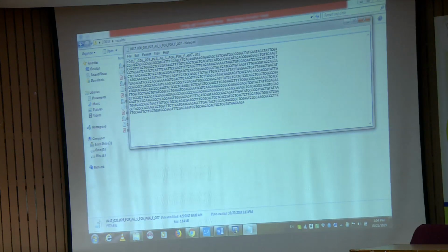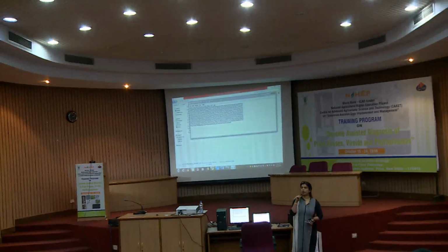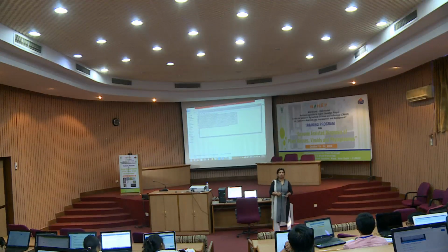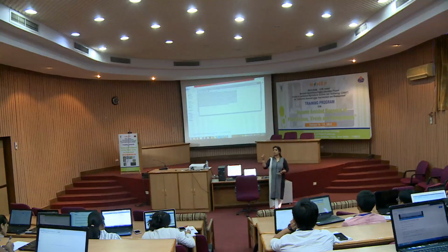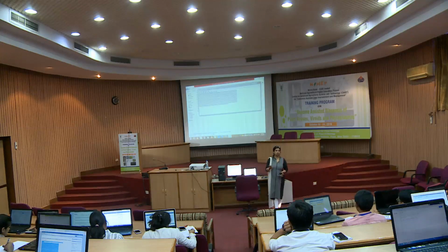So, for that you want to know the quality value of each base, right. The chromatogram file will tell you the quality value of each and every base. If the Q value is more than 30, then you can consider that base. Otherwise there is some doubt that either the sequencing data is not good, or something is missing, or the machine condition is not good, or there is some impurity in your sample, which means the sequencing data is not good at that point, right.